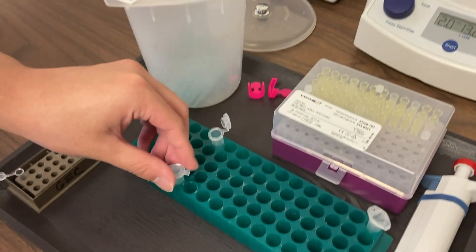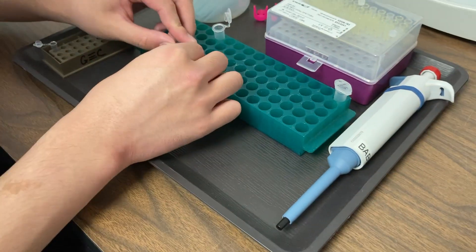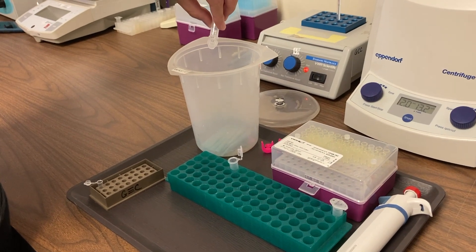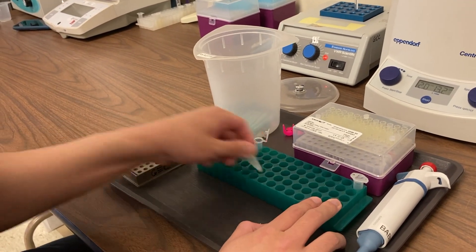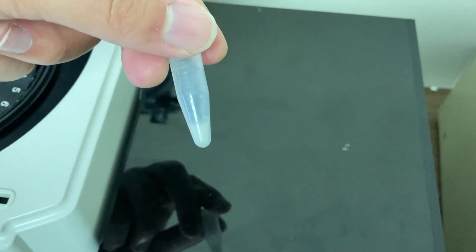What you're going to do next is pour off what's called the supernatant. The supernatant is the liquid on top of those cells — we don't need that anymore, that's just saline. We have about 50 microliters left on top of your cheek cells, and we're going to rack those cells to mix them up really well in the remaining bit of saline.